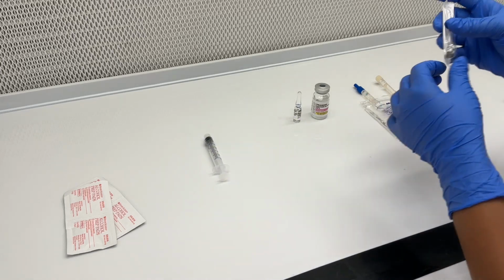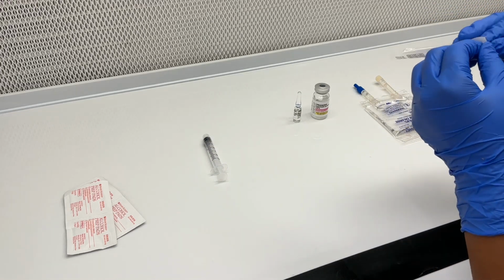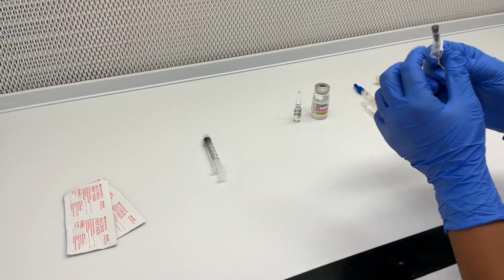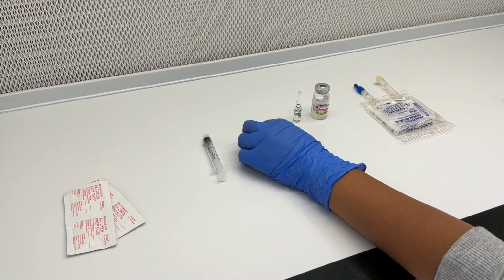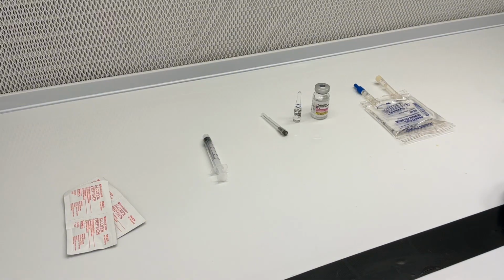Okay? Same with the needle. So with the needle, if I can get it open, this would be first air because the hub of your needle is facing the filter. This would not be first air.